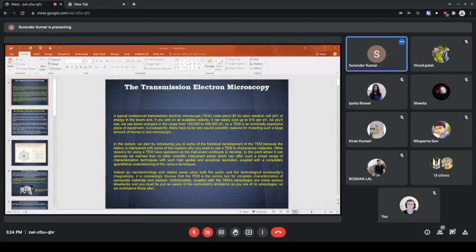In this picture you can see the first electron microscope, which was built in 1930. So why use electrons? You are familiar with the optical microscope very well, you know how it works. The working is the same, but now people are using electrons. So why should we use an electron microscope?